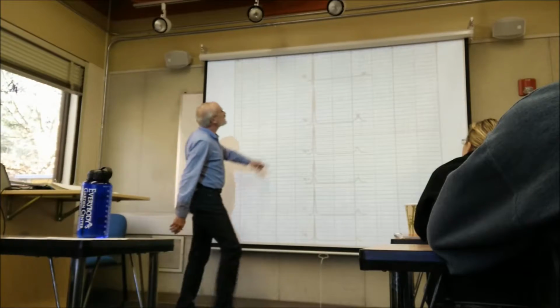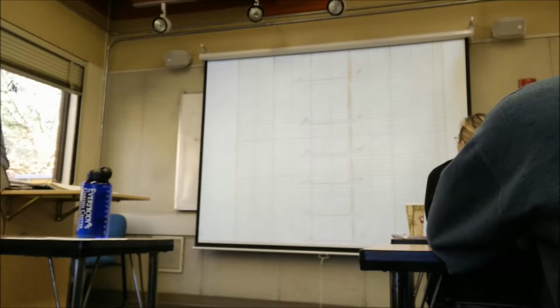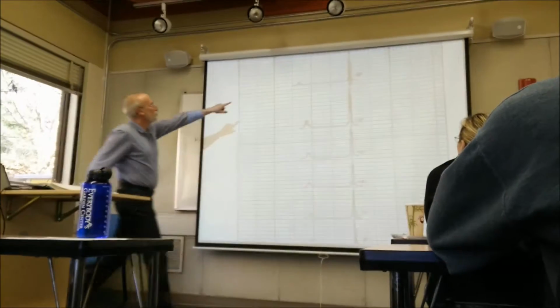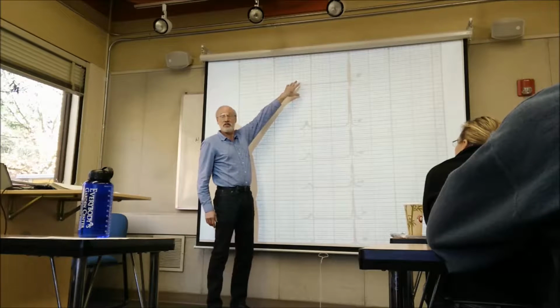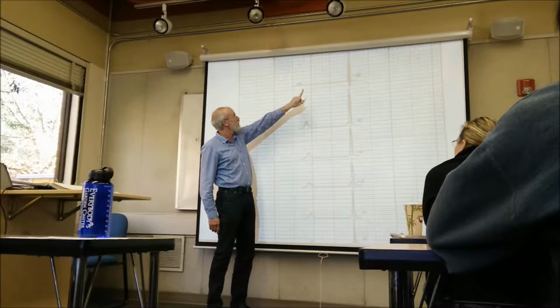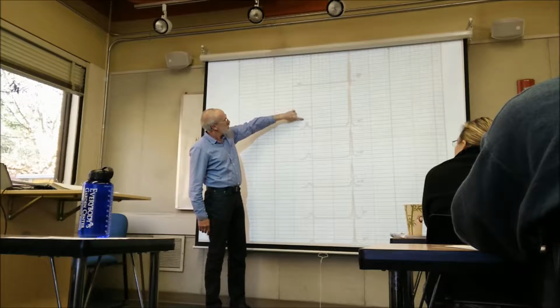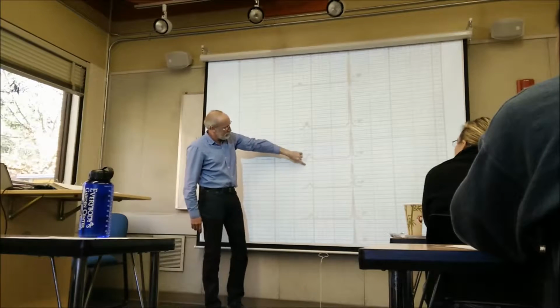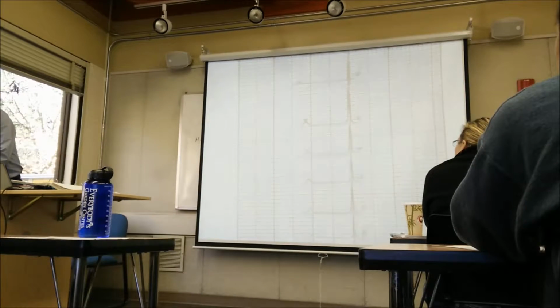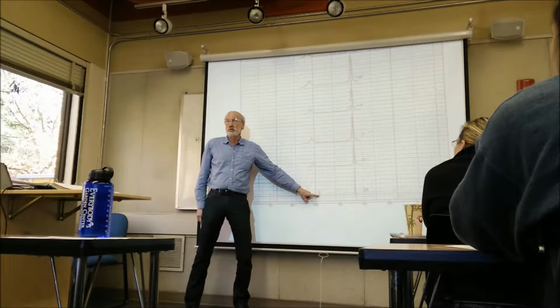And you'll notice, look what happens to the splitting. This is minus, whoops, the other way out. There we go. This is at minus 40 degrees. So the hydrogens on the oxygen are coming on and off very slowly, at a frequency less than this resonance frequency. And as you slowly heat up, you see those peaks broaden and broaden until finally, way down at the bottom, at 31 degrees, it's become a singlet.